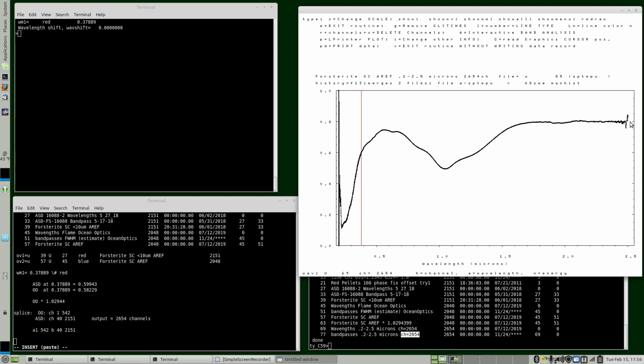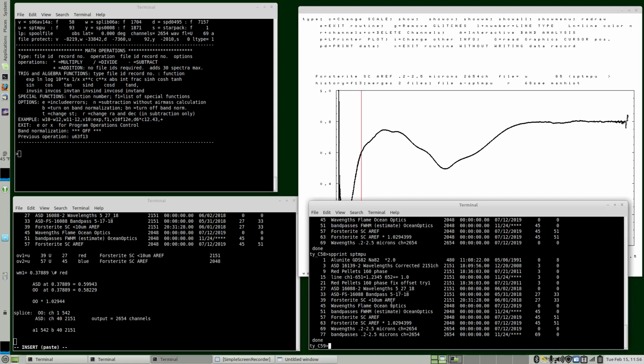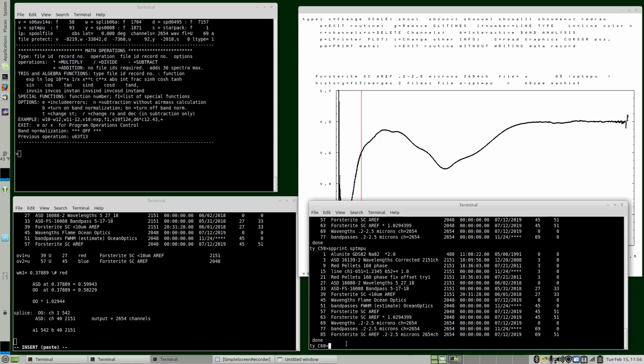Some data may be good all the way out here. Some data may be good to a shorter wavelength, and it may be important for some interpretation of, say, some spacecraft data. So Specpr tracks deleted points. So let's go ahead and save this spectrum. So we have this merge pending, and we type E to exit. The data is written, and we can check our range here. So now let's delete the bad points.